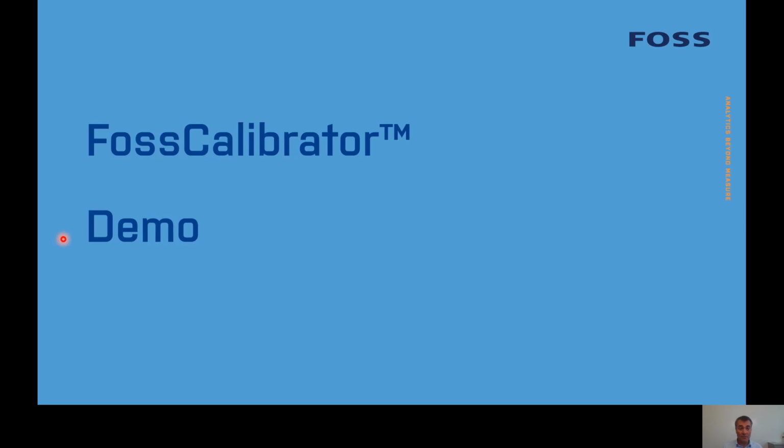And my good colleague will now take you to FossCalibrator and give you a demonstration of how PLS and ANN can be used for developing application models.